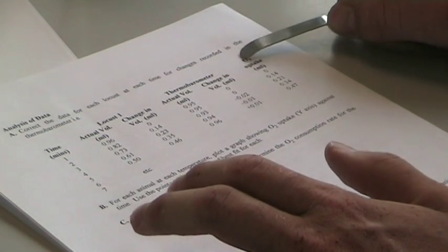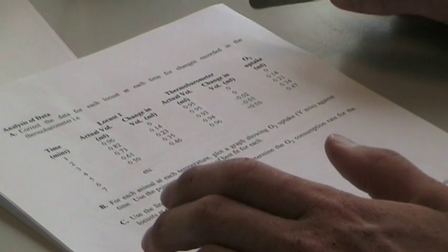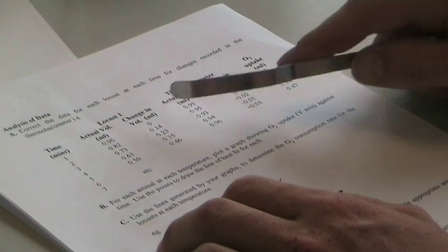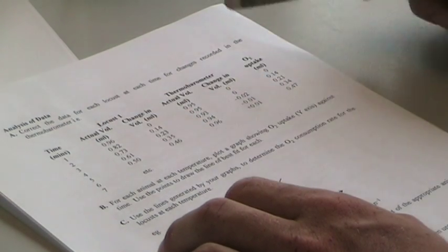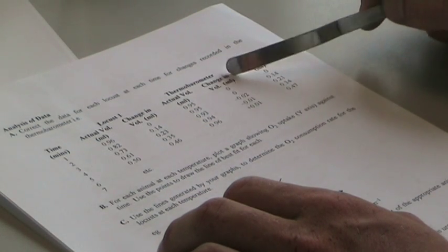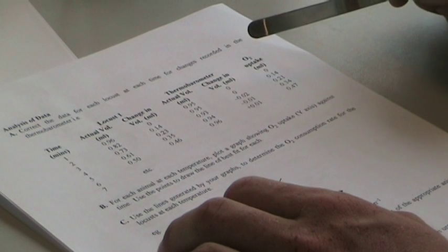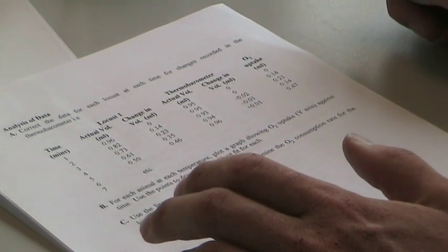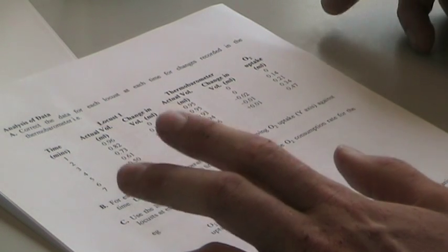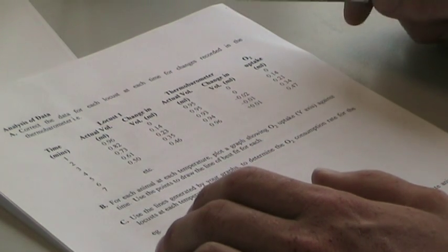To calculate the actual O2 uptake of the locust, you would add the change in volume from the locust column to the change in volume from the thermobarometer column. Therefore, you've taken account of the locust respiration and the changes in temperature.